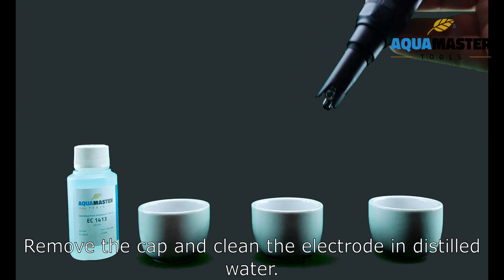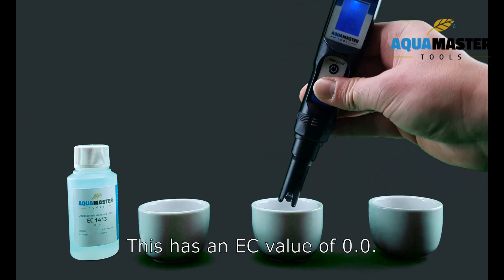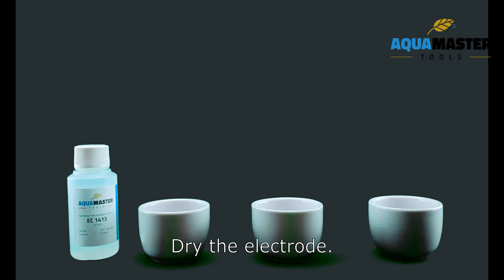Remove the cap and clean the electrode in the distilled water. This has an EC value of 0.0. Dry the electrode.